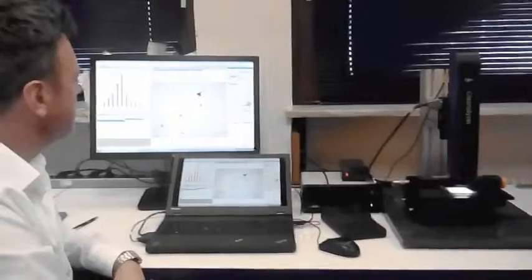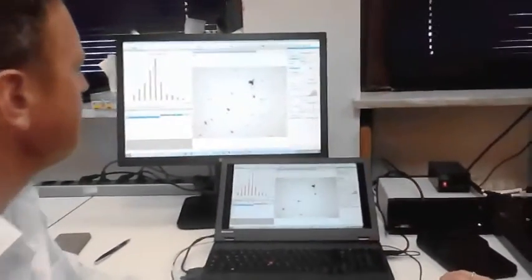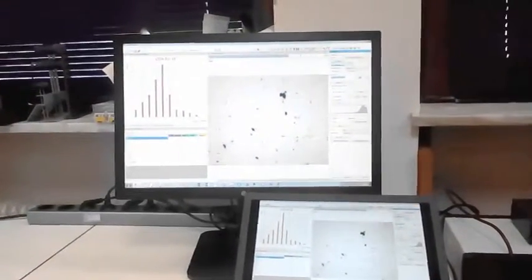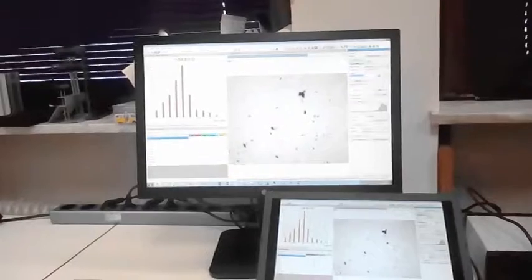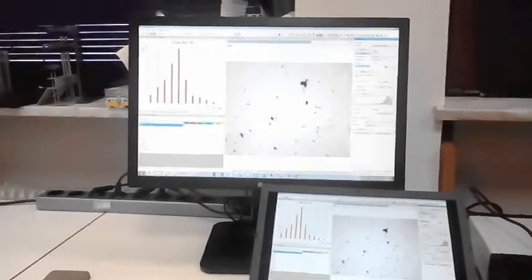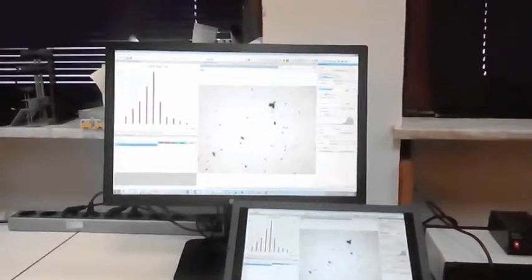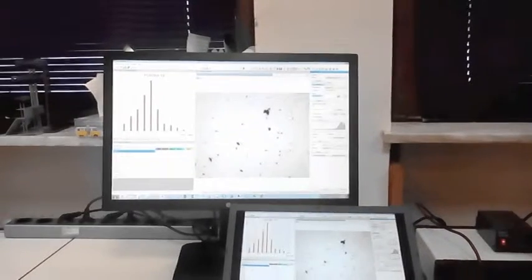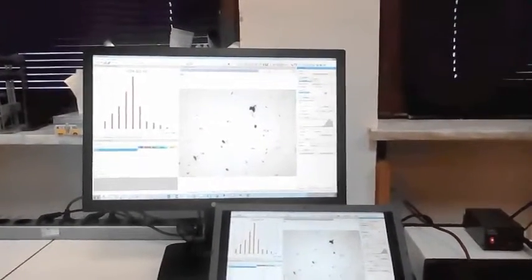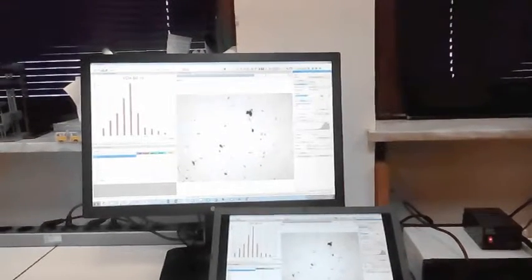So what's next? The next thing we have to do is choose a profile. That means we have to choose our measurement settings, how we would like to do the measurement, and all this is saved in a profile. In our example, we would like to detect metals, and that's the reason why we are choosing a profile called 2-pass. It's a drop-down list. We have the right profile.